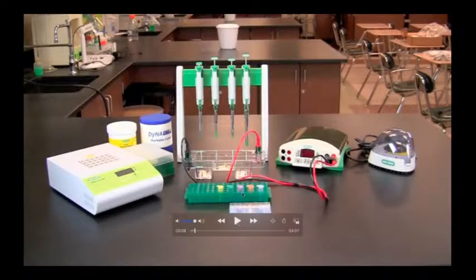So this is the basic apparatus that you need. You need an electrophoretic unit with a voltage regulator, Eppendorf tubes, and pipettes. You need to calculate how much protein or DNA is there. Those are the basic things that you need. So let's start.